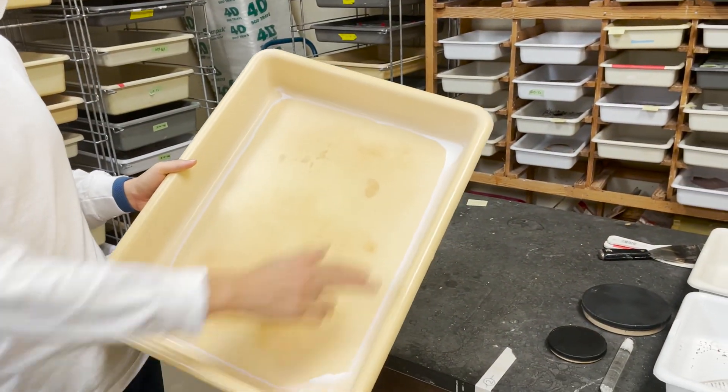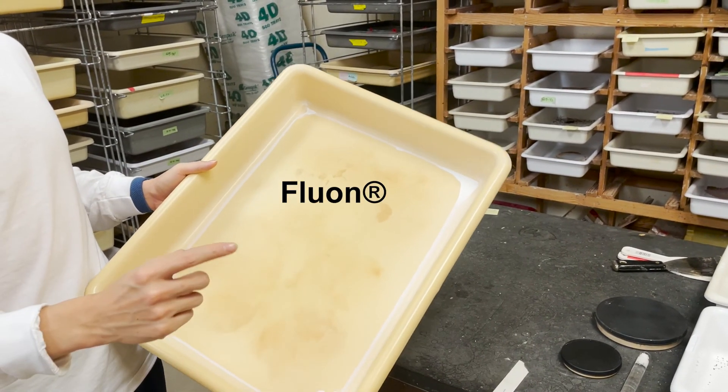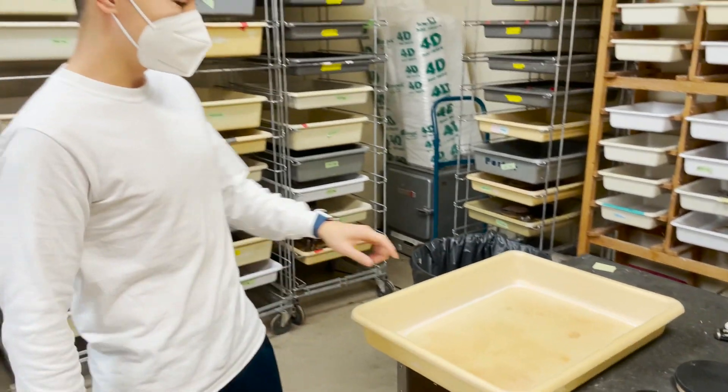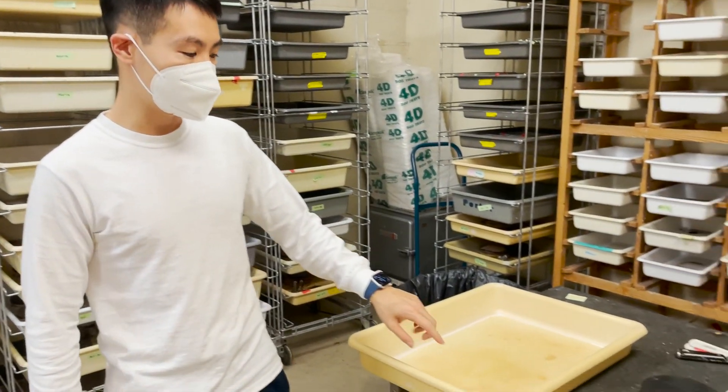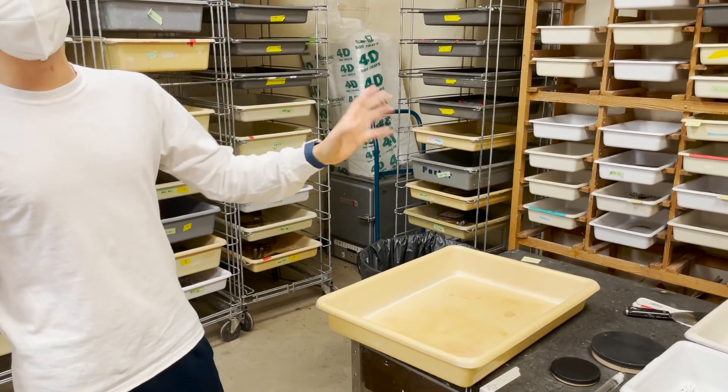This tray is fluoned on the side so that the ants cannot run out. But over time, the fluons will get degraded because the ants keep wearing it down, and then we'll have to move them into a new tray.